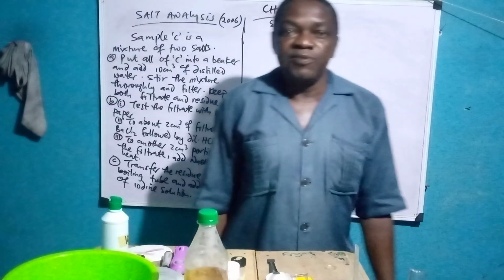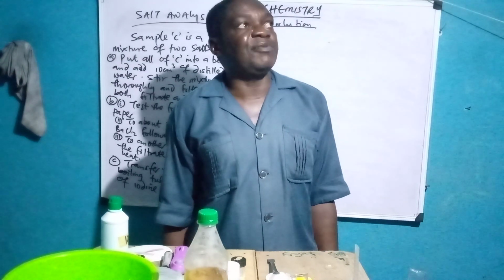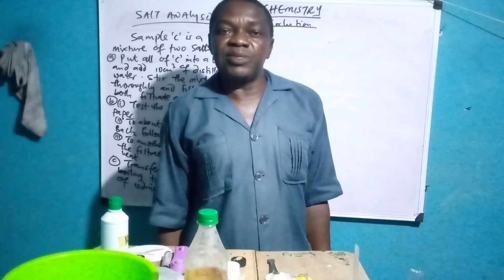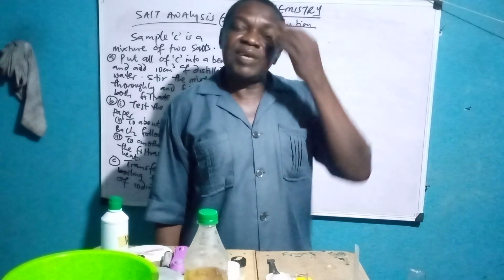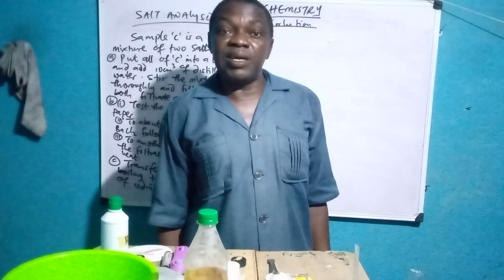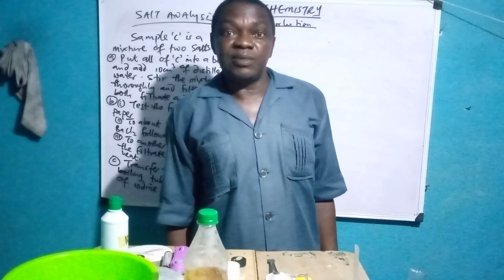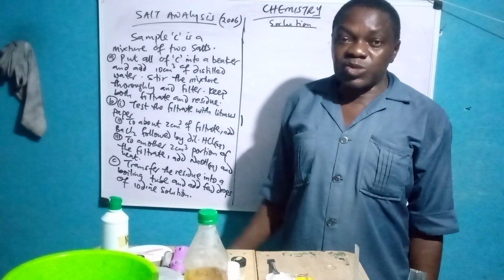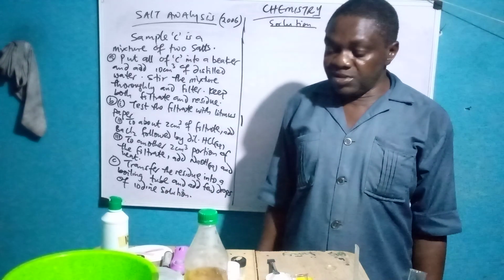Before we go far, if you listen to some of the videos I've already given you, you will find out that I gave instructions. Apart from the titration aspect, I also gave instructions on what you must follow, precautions you must take cognizance of when you are carrying out salt analysis. So as we go, I'll be explaining them in detail.